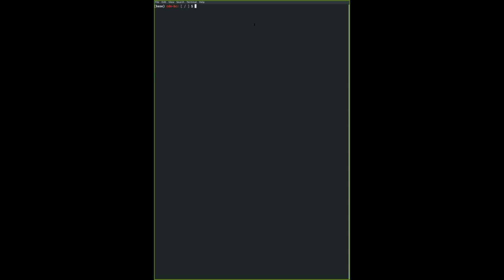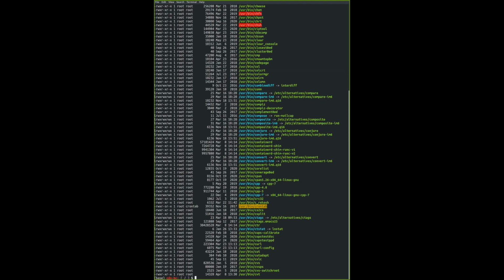Okay, so how do we do this on our own terminal? So the function is ls -l, and we're going to use /usr/bin and call out anything that starts with the letter C. This is the same as what we did previously, C followed by an asterisk. So we have this. Mine is quite a lot. Hopefully yours is not too bad.